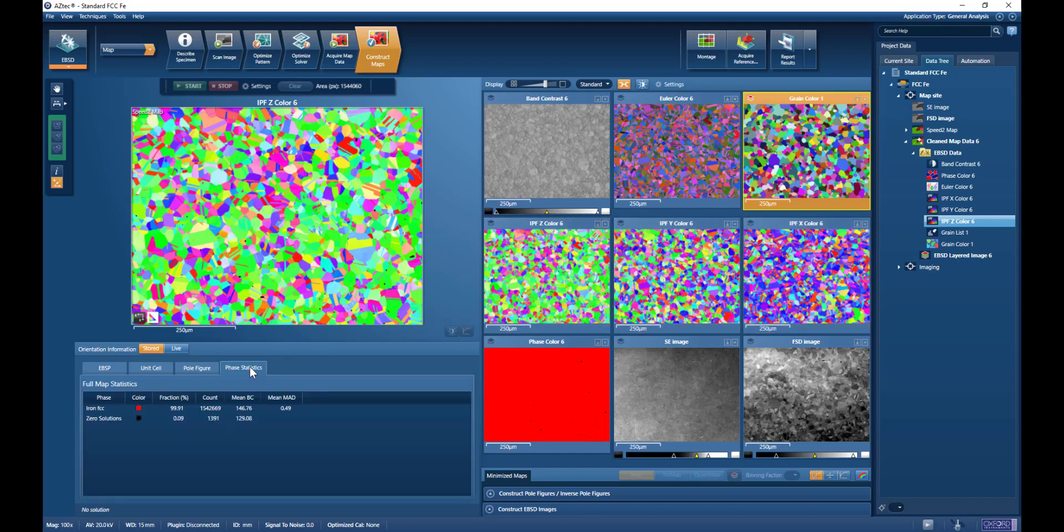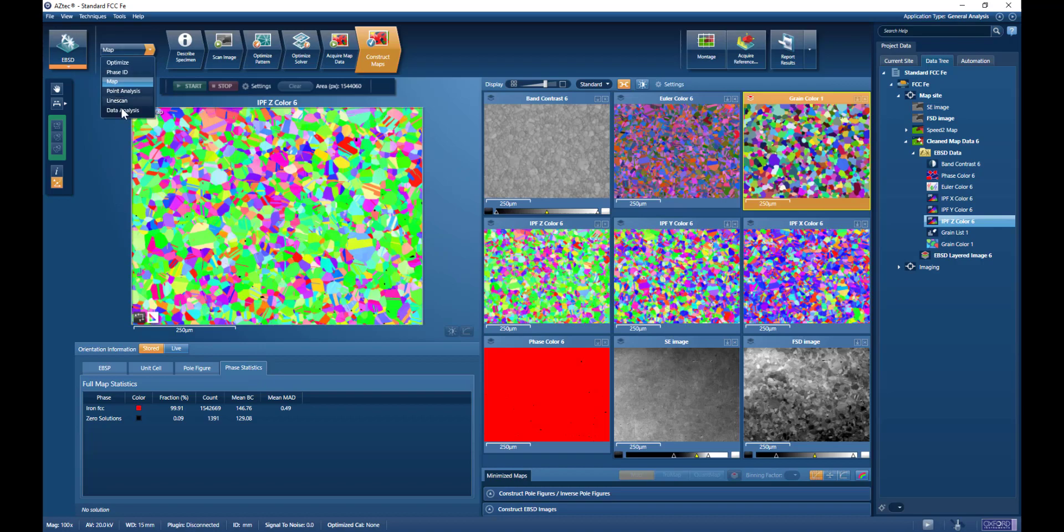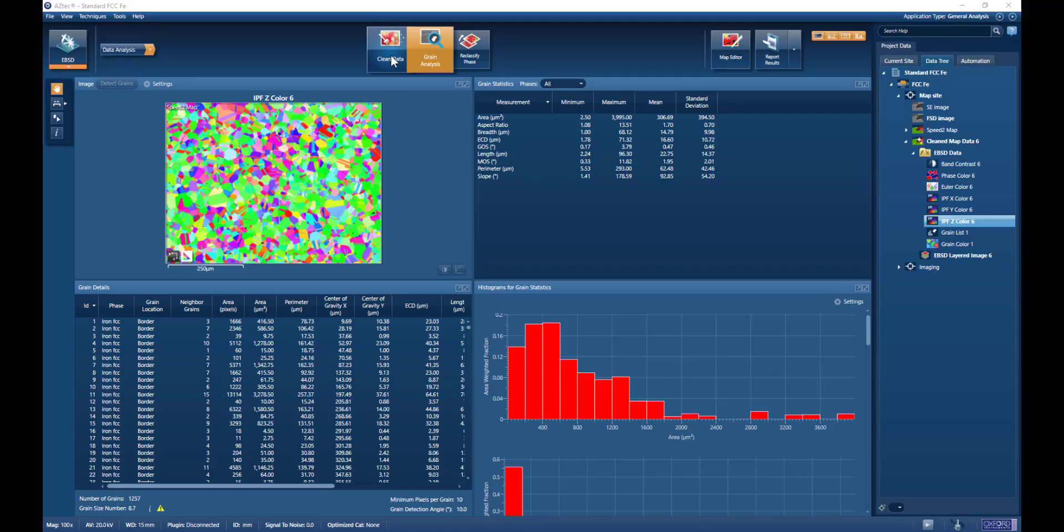However, if we want to look at grain size within the Aztec software, we need to switch from the map mode to the data analysis mode. Here we can see that we have a number of choices of what we can do in the data analysis mode.